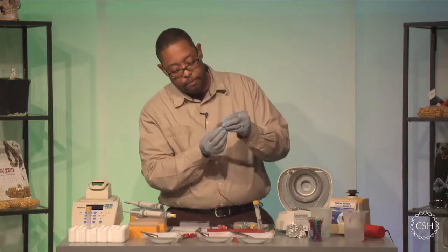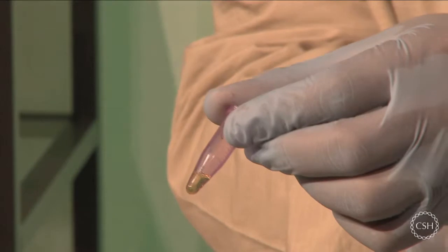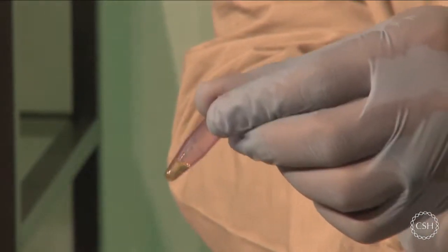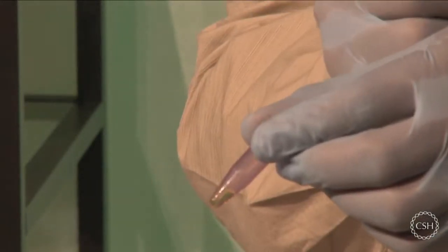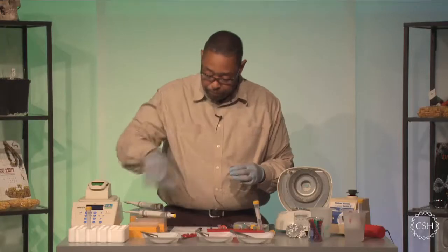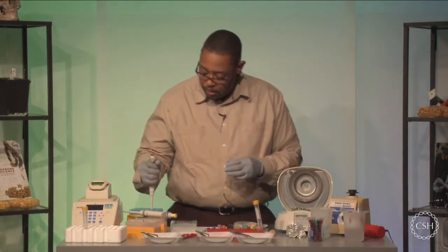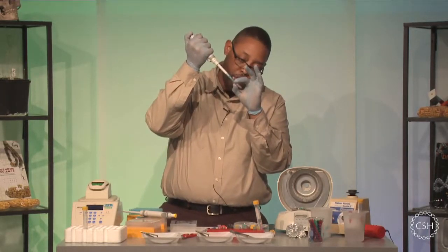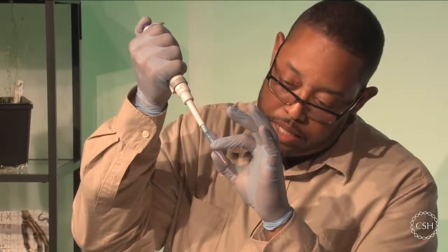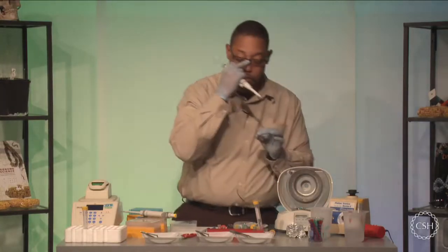So as you can see here, I have my silica resin at the bottom. It does have a little bit of green in there, but that's okay. But I want to make sure that that pellet, which is at the bottom of my test tube, is going to be void of the supernatant. So I'm going to take this out of there. So what I'm going to do is switch over to using my P1000 one more time. I'm going to draw the full 150 microliters of the supernatant out of there. I want to try and get as much out of there without disturbing the pellet, so do not touch the pellet at all. Remove as much of that liquid as possible and expel that into a garbage bin.